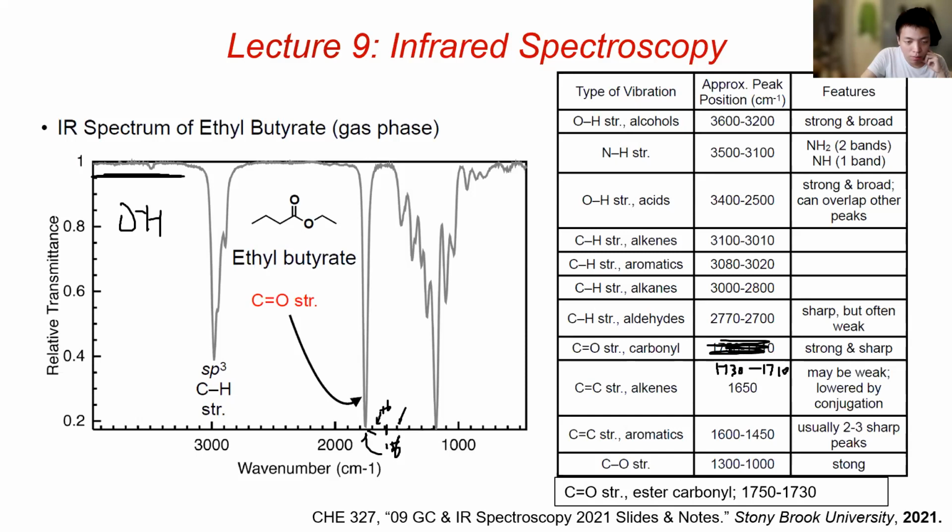You can also have the chart on the side, or maybe it's probably in the exam. The carbonyl stretch is strong and sharp.